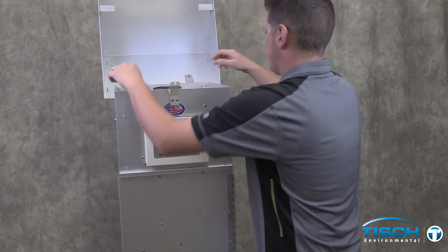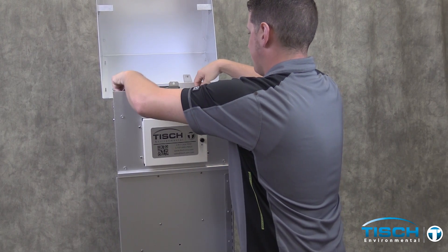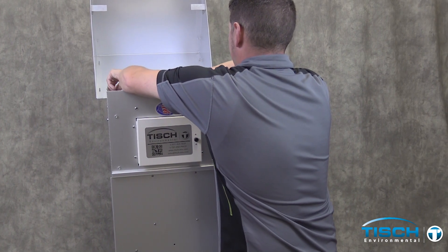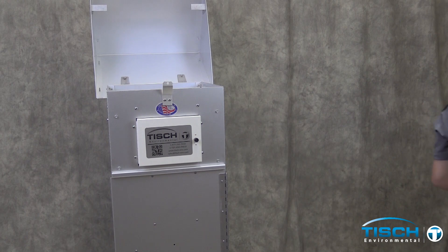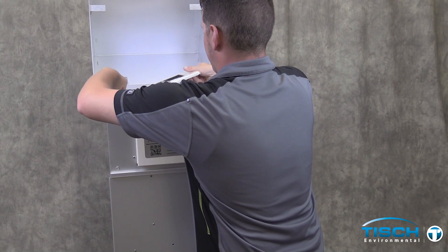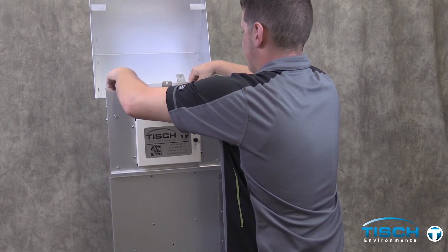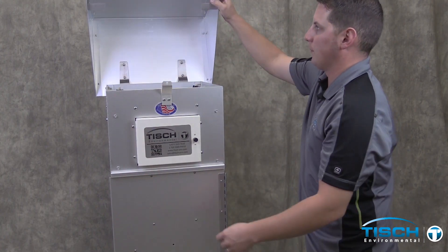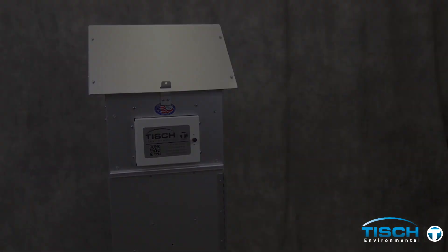Remove the calibrator. Close the door on the shelter. Remove the adapter plate. Install the frame. Make sure the four plastic washers are on the top. Close the lid. This completes the calibration of the mass flow control air sampler.